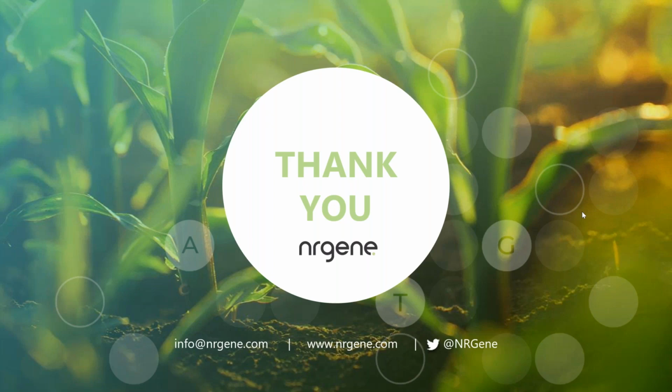I explained some of it in a large overview, but this was a very large bioinformatic effort by a large group of experts to filter, and you can see that we zoomed in from the 21 million that we started out with to 200. So you could be sure that the 200 that we chose, we have great confidence in them, otherwise they wouldn't be in the panel. That's the broad answer without going into details again.